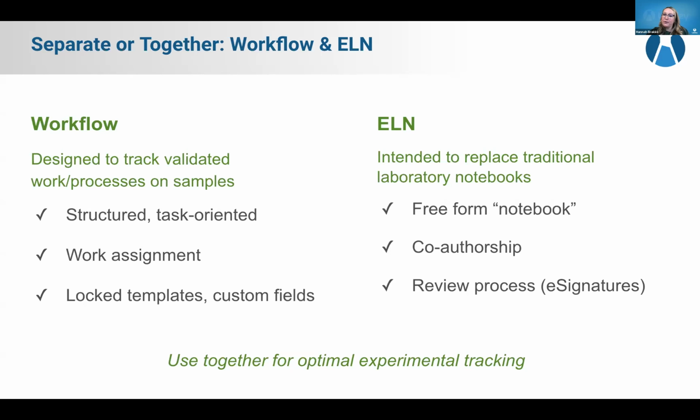We do allow for a collaboration piece as well in terms of co-authorship, recognizing that nobody's doing science in a vacuum. More often than not, you're probably working on an experiment together. This allows folks to collaborate and contribute to that notebook separately. And then finally, we also have a review process that includes e-signatures that help support Part 11 compliance and other regulated environments.